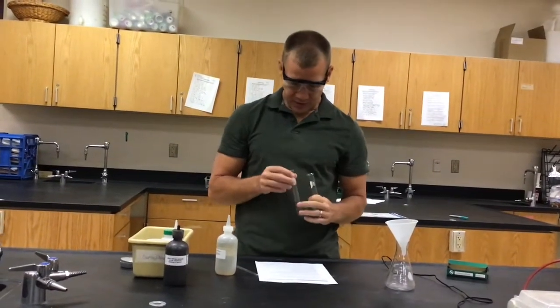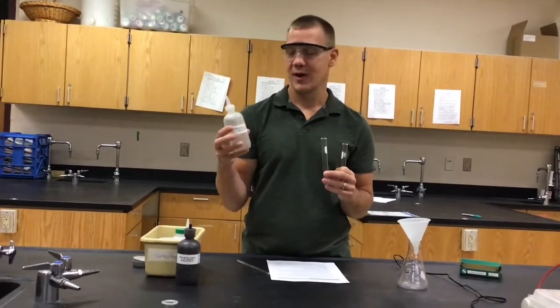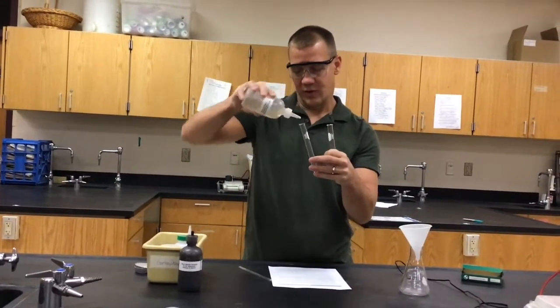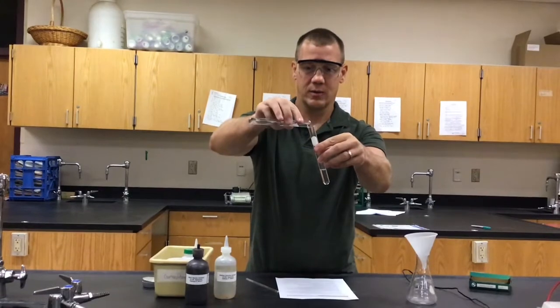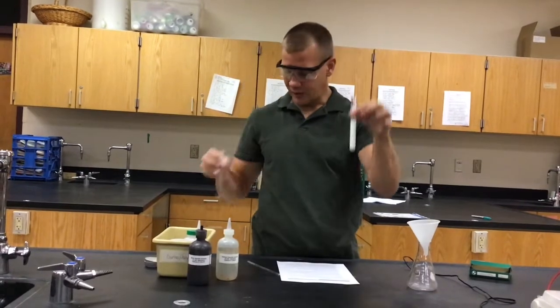Then I'm going to add the same three to four milliliters of sodium chloride solution — that means there's salt, sodium chloride, dissolved in the water. So once again, three to four milliliters. Then I'm going to mix them together by pouring them together, and it goes from two clear liquids to a nice white opaque mixture.